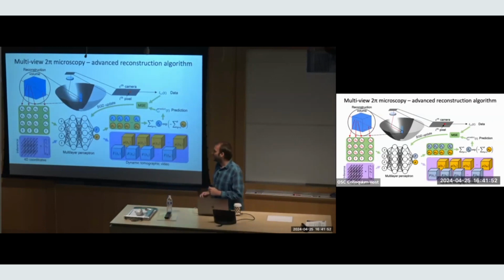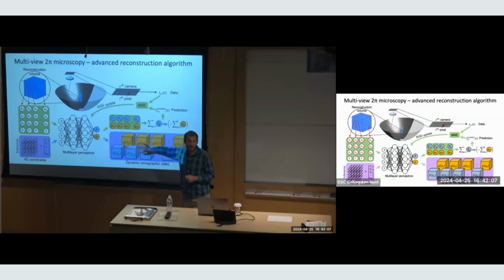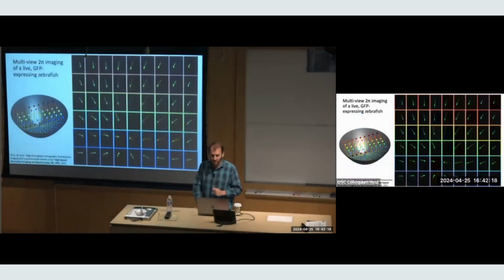Doing that has the nice benefit that we're able to get this network going for one frame, which takes a while computationally, and after we've done that, we can fix this network effectively and then use it for all subsequent frames. So it gives us a speed up of processing time, whereas before, each frame we had to process individually. Here we can use this bootstrapped approach.